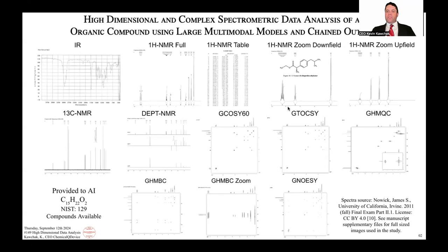Regardless, when you're dealing with this amount of data, and again, with part C, it was turned into text data, which is still a lot because I have to pick all these peaks, and there's just so many things to look at all at the same time. The large multimodal models in this specific case, or LLMs, Grok 2, I didn't have, well, actually, I think it can output images. Regardless, these models are doing some type of effective automated processing, and it's definitely a developing thing.